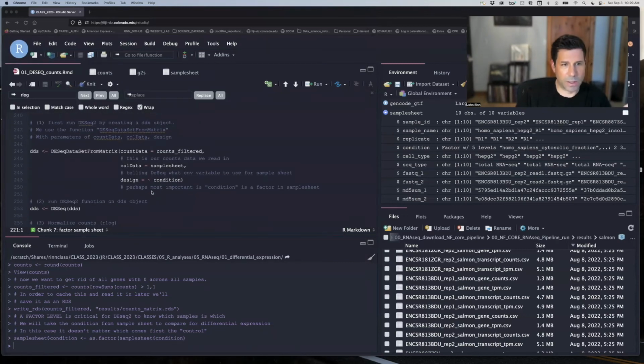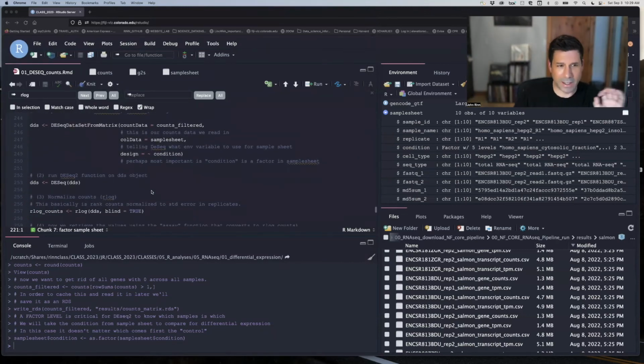Okay, so this is really what we're going to run, DE-seq. It is fast and it is very little code, but is a lot of setup, as we can see. But we are finally there. That document also has the DE-seq functions in it. What are the main ones to use? That is also quite handy. And so this is just things to memorize or copy and paste from. But first we need to set up a matrix.